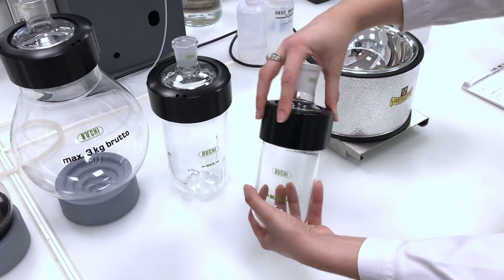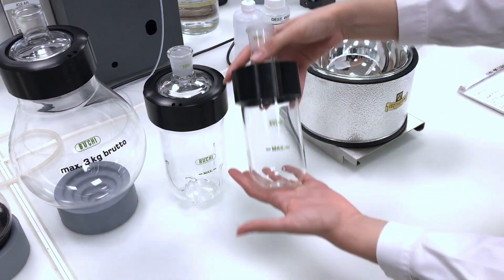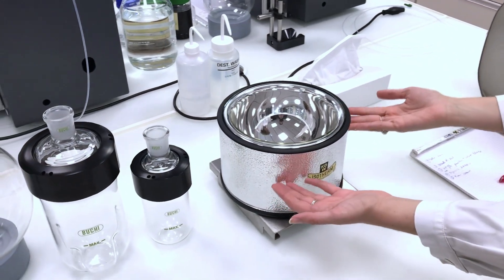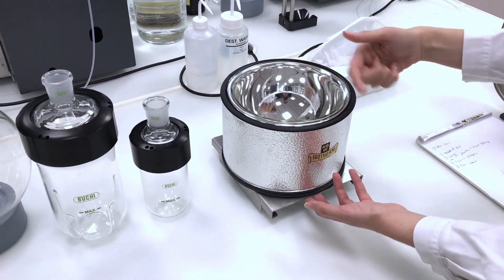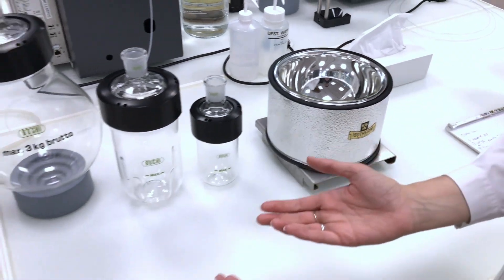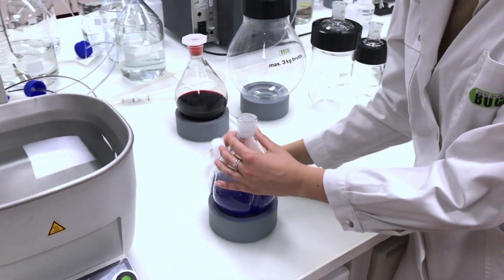And next here we have what we call the Dewar accessory. If you want to do some freeze drying sample preparation, you put this instead of the bath, put your flask, and then it just prepares your sample for freeze drying with dry ice inside.